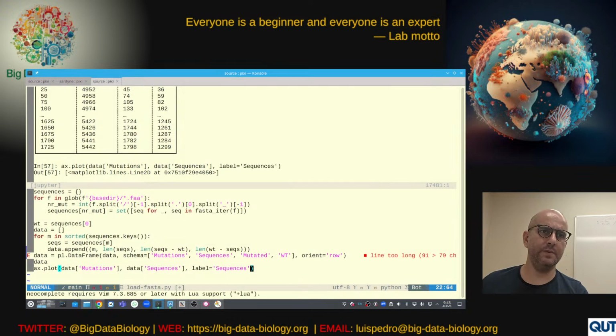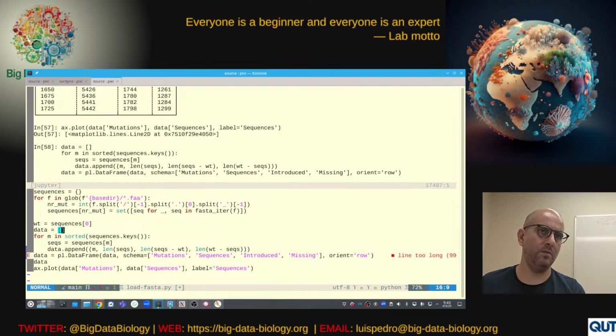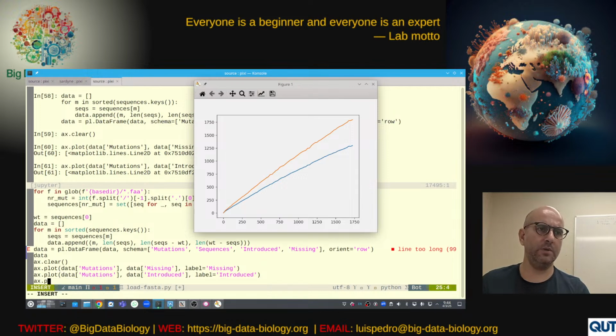Okay, number of sequence goes up. Okay, yep, this is it. Just to be sure, x plot.